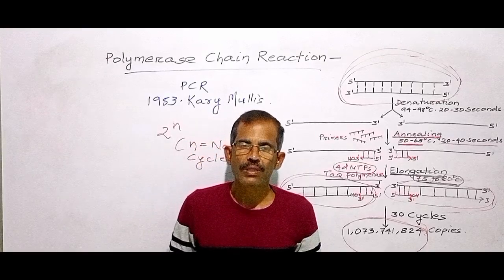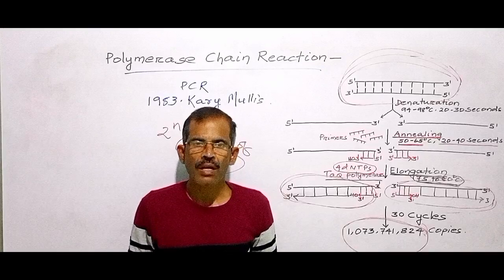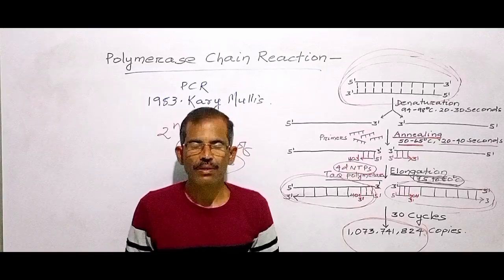Today we will discuss conventional polymerase chain reaction.